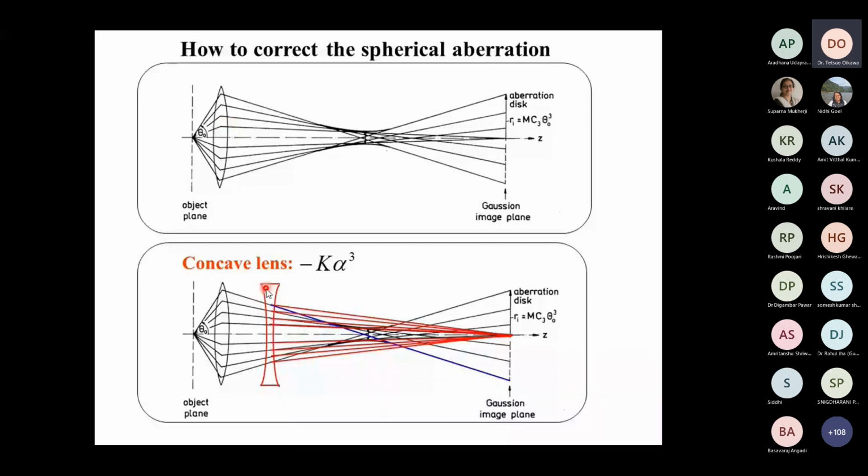But practically, a magnetic round lens system cannot generate this. Then a hexapole, octapole or dodecapole multiple aberration corrector is applied in commercial instruments. Then finally, we can correct the spherical aberration. We can clearly observe a very fine focus on the image plane.